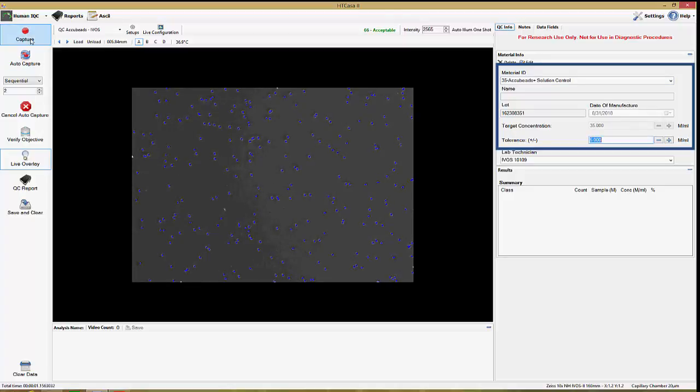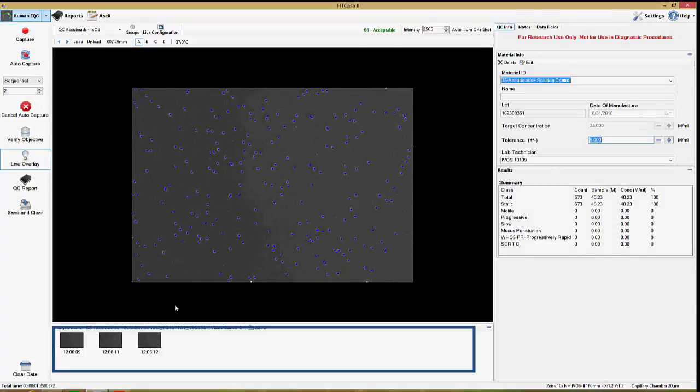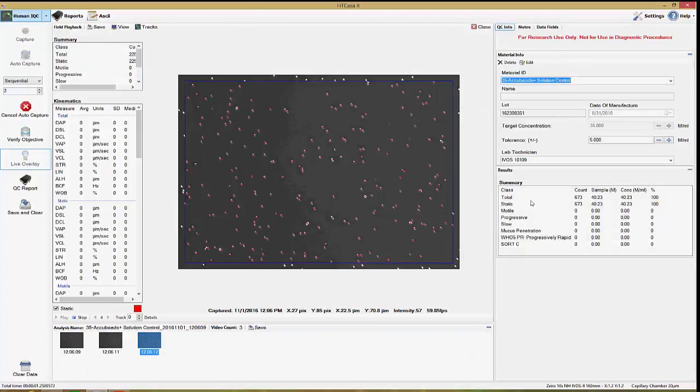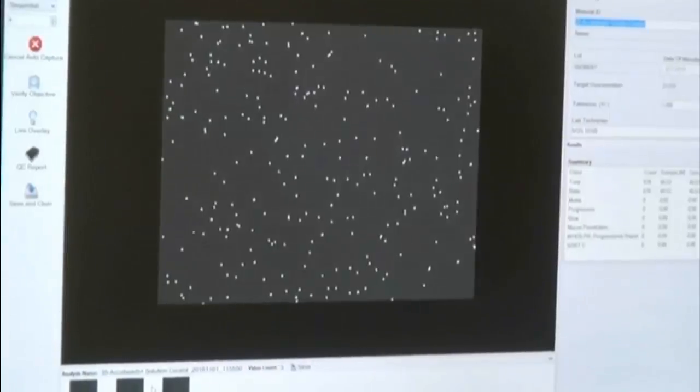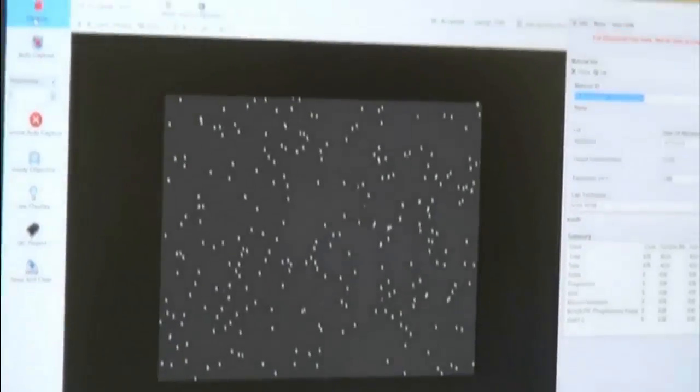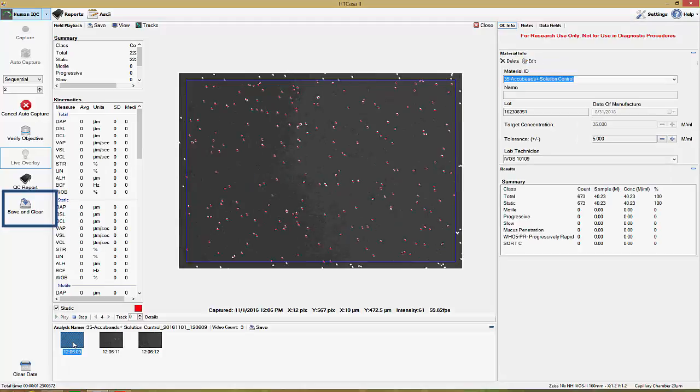Do the analysis of the materials. You can review the analysis of said materials, review the capture of all of those beads. If you did an analysis where there was an air bubble, you would be allowed to remove that from the statistics. All right, and here you can see the analysis. So do a manual addition if you'd like. Okay, and when you're ready to save your data set, this will be just outside of the range.